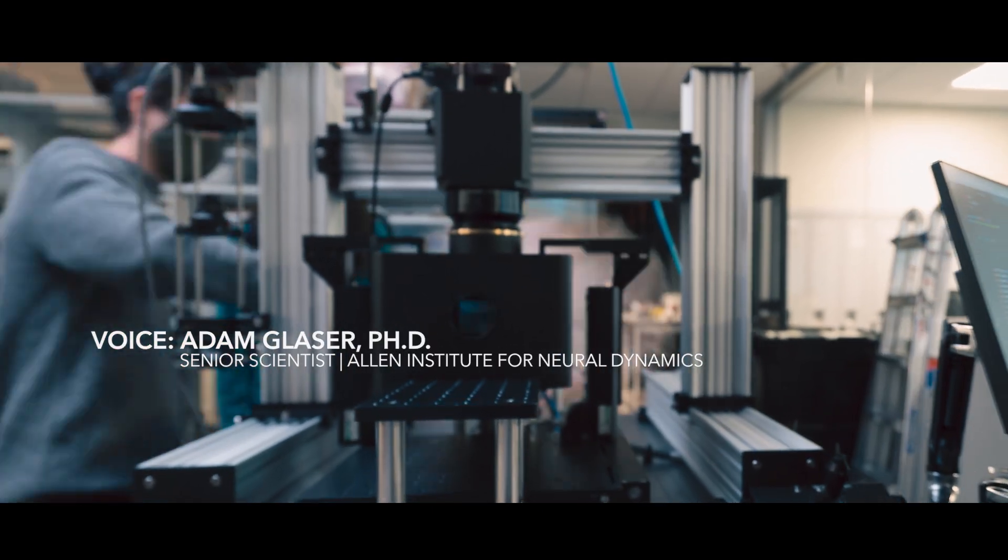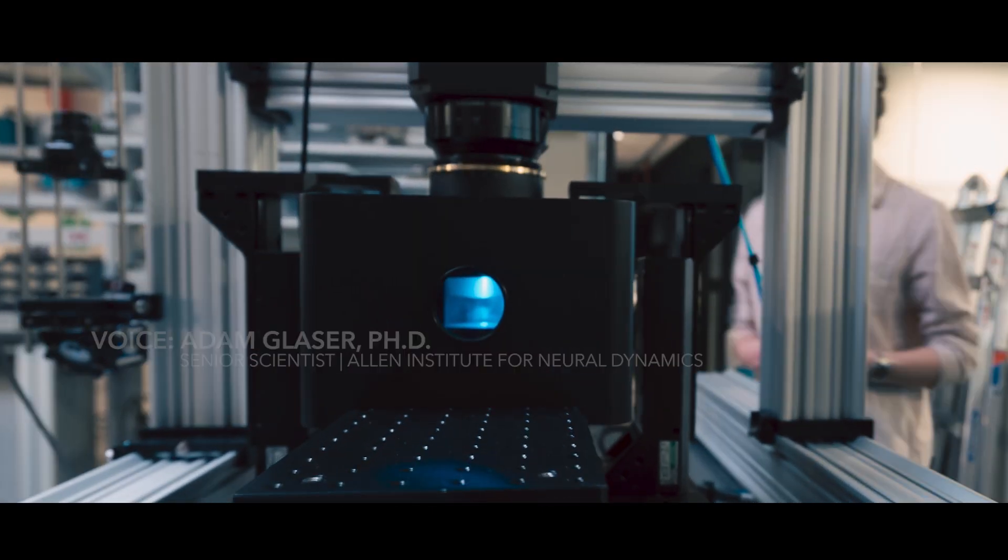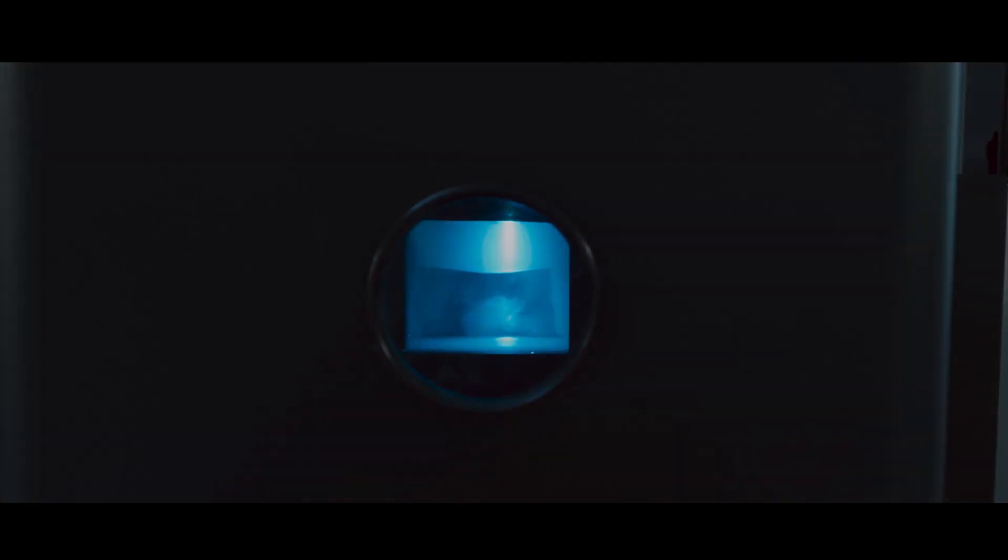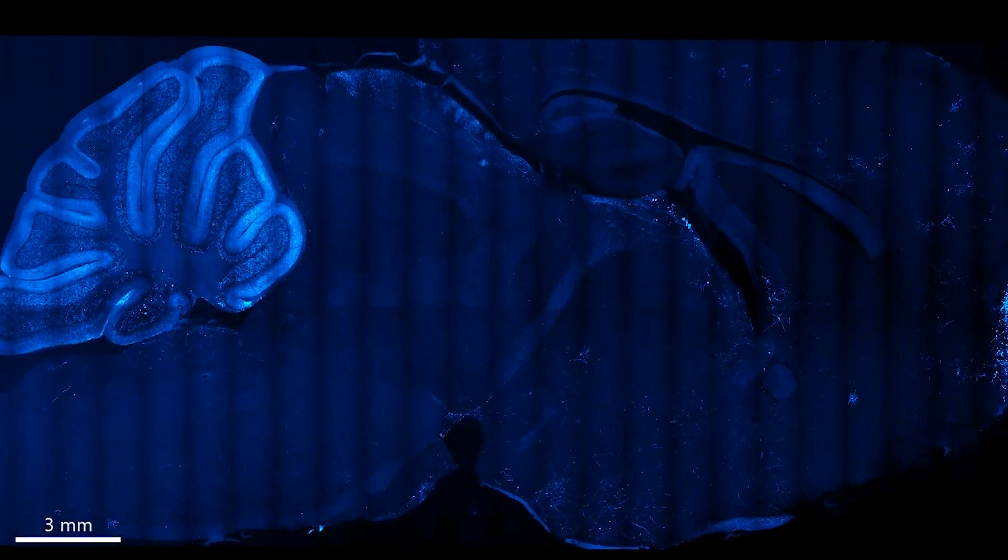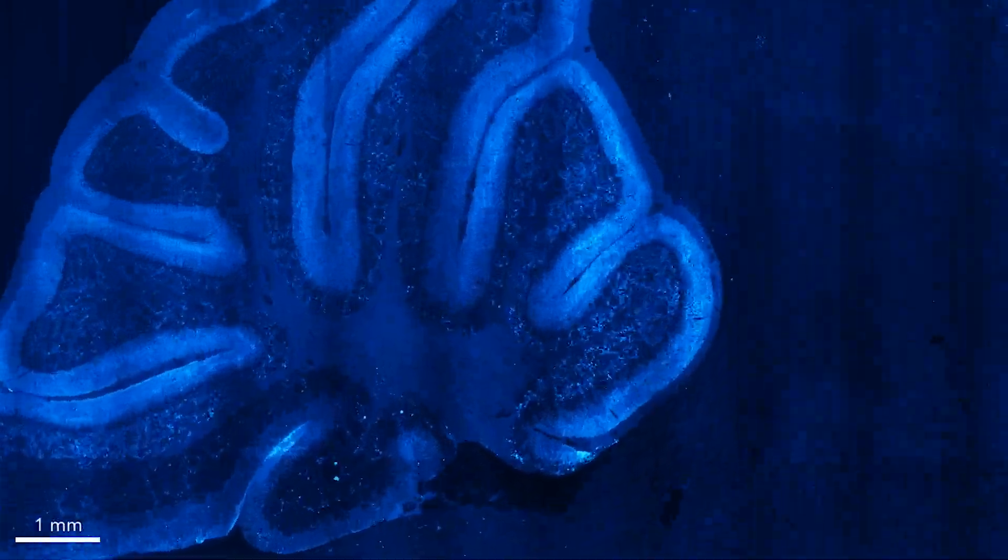What we did when designing this microscope is leverage these lenses and cameras that have been developed in the machine vision space to look at individual neurons and their axons within mouse brains.